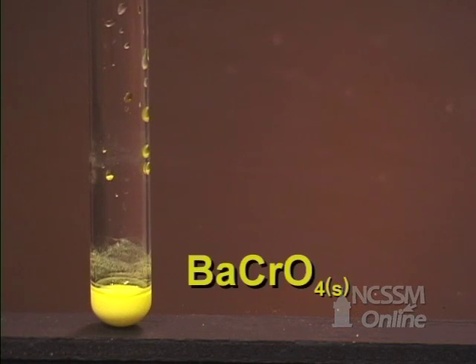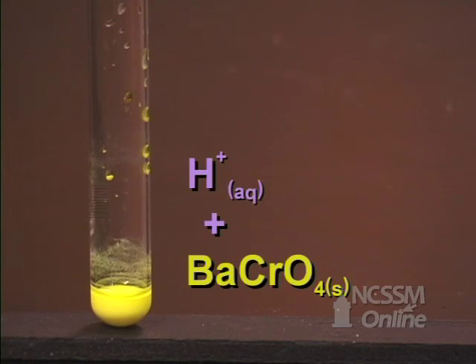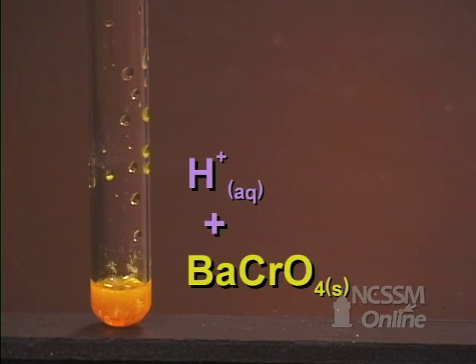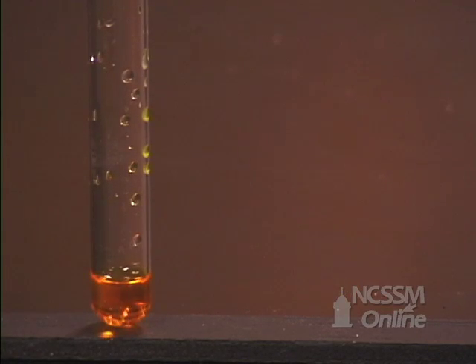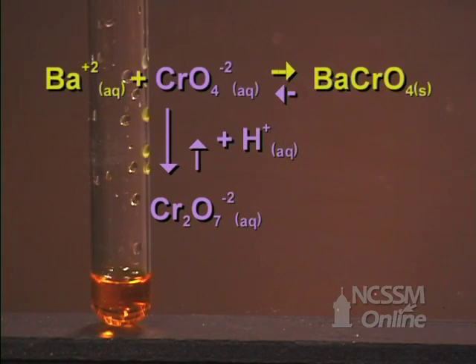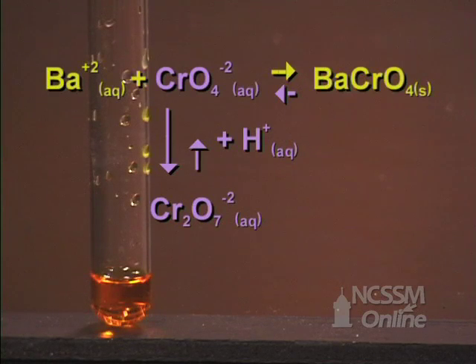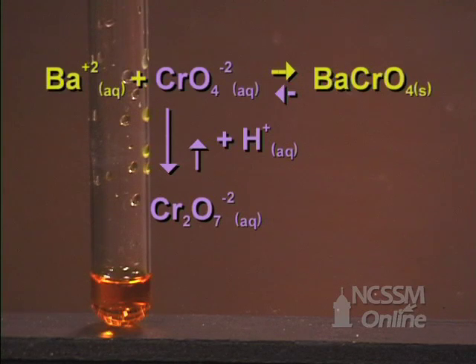If we take some of the solid barium chromate and add 6 molar nitric acid, we see that the solid goes back into solution and the solution turns orange. Adding the nitric acid provides a source of hydrogen ions. The hydrogen ions combine with the chromate ions and shift the equilibrium in the reverse direction to form dichromate. The solution turns orange. As we add more and more hydrogen ions, the equilibrium is forced further in the reverse direction and the solid completely dissolves.